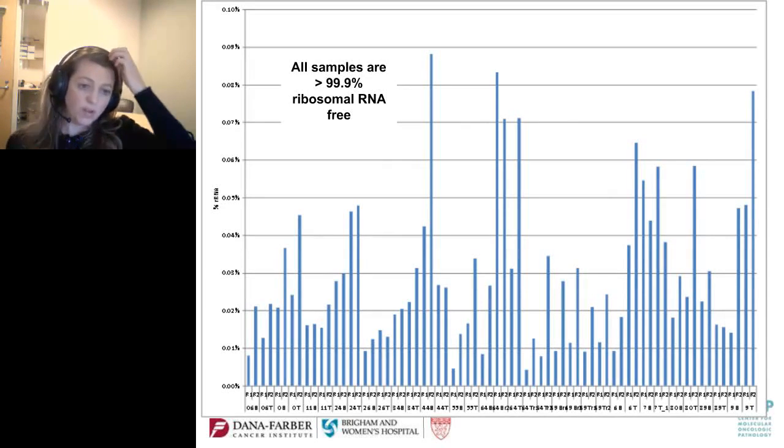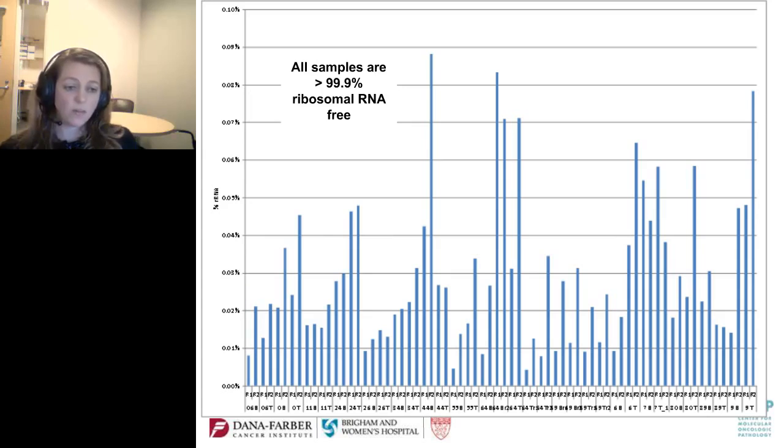As I mentioned previously, we have tested a number of different library prep methods regarding ribosomal RNA. When we started this testing, probably over 1.5 years ago, we had not thought about removing the ribosomal RNA; we actually wanted to see what the ribosomal RNA component was.